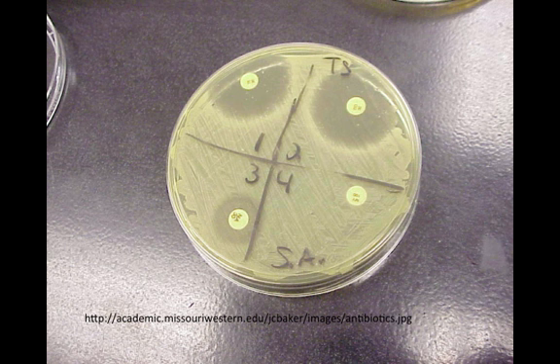On this plate, the researchers have set the test up to test 4 antibiotics at a time. Note that the antibiotics are on standardized discs that are coded with respect to what antibiotic the disc contains and the dose that it contains. A bacterial lawn is created on the plate with your bacteria of interest. In our experiment, we'll use the resistant bacteria that you've created through the agar diffusion test. And you then place the filter paper discs down on top of it. You incubate that plate for 24 hours at 37 degrees Celsius and then come in to read the results.